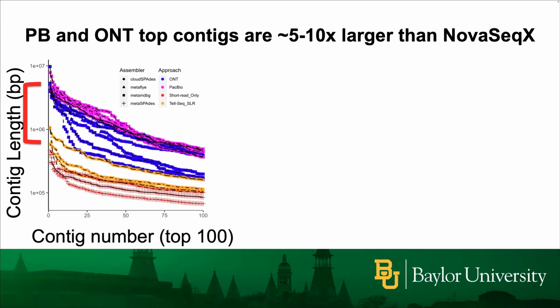So immediately when we compare the top 100 longest contigs from these technologies, you can see that long read approaches or single molecule approaches, both PacBio and ONT, are clearly an order of magnitude higher than the short read approaches.